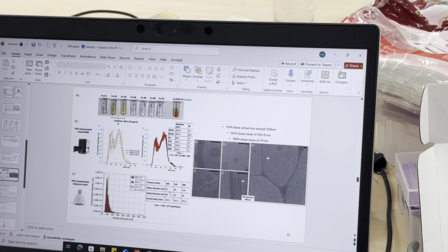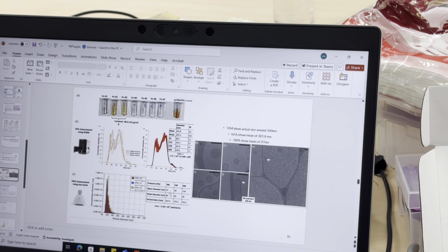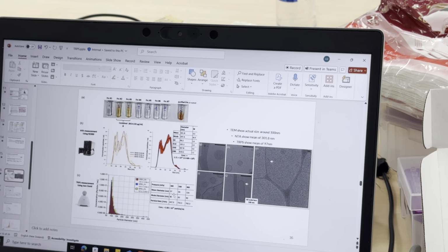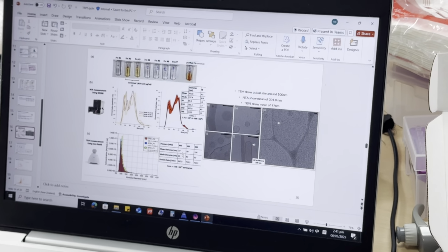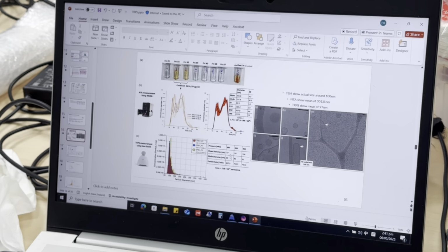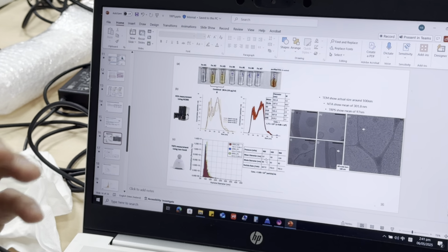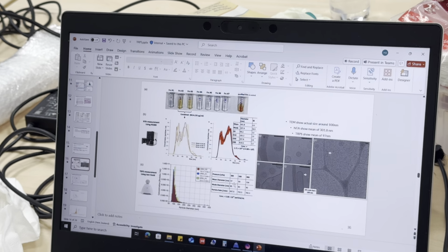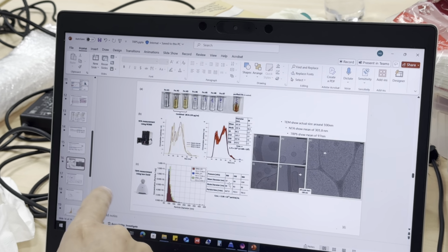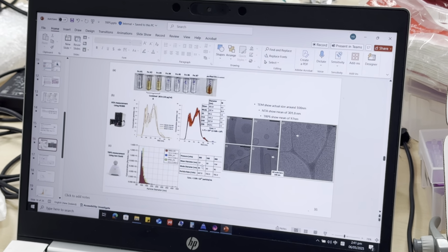Usually, even vaccine manufacturers use large columns. They just sanitize them with sodium hydroxide. It's not sterile. Sterile means you need to use gamma radiation or ETO to sterilize it. It's not that possible, and it spends a lot of money. It's not efficient. But when they make sure the size is in the range they want, they can easily use a 0.22 filter to do a last-step filtration.